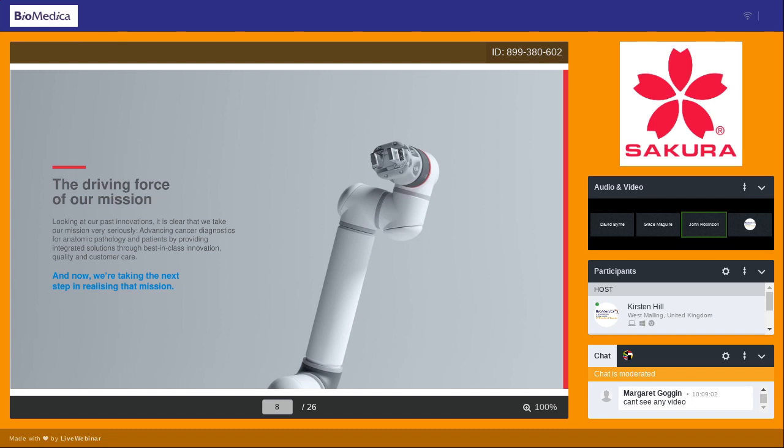This is a very interesting webinar for me to do today because this really is something different. I'm asking our audience to try along with us and visualize what the future may look like in our histology world. We spent many years where very little has changed. About 5 years ago, I got involved with the Sakura Smart Automation line portfolio, and we brought Smart Automation to several sites across Ireland, North and South. Today, we have about 10 platforms across the island.